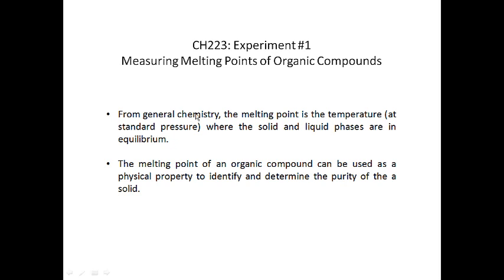In general chemistry, you learned that the melting point is the temperature at which the solid and liquid phases are in equilibrium. It's easier to just remember that when a solid melts or when a liquid freezes, that's the melting or the freezing point, which are exactly the same temperature.